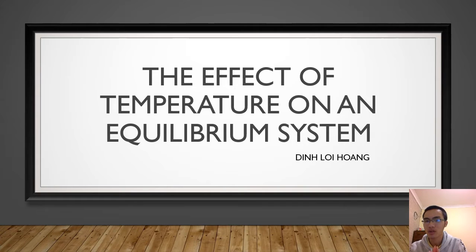Today I'm going to show you one interesting chemical phenomenon. This is a chemical equilibrium system, and I will show you the effects of temperature, how this happens, and how it applies in real life. Now let's get started.